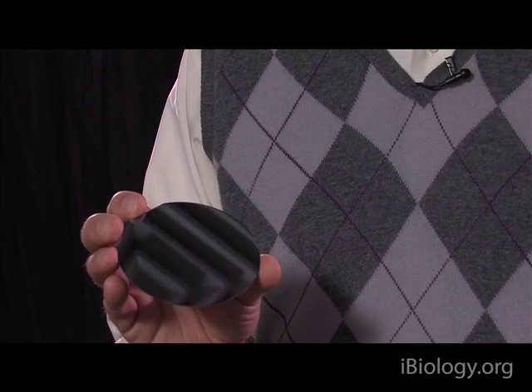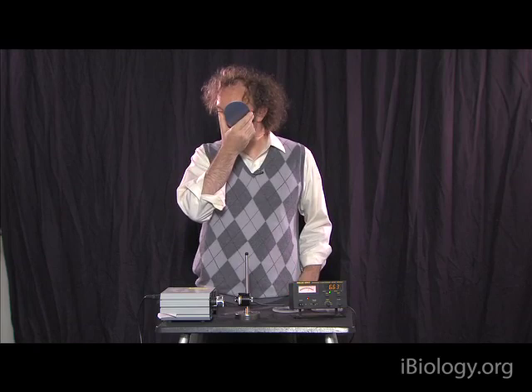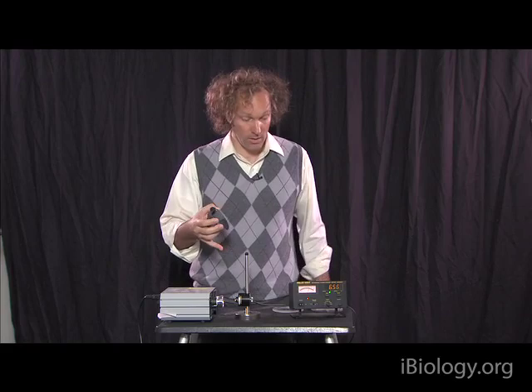So maybe you can see this a little easier. It's highly reflective. It's a piece of silicon. And if I put my eye up to it and try to look, I see nothing through it. So I might expect, when I put this in between the light source and the detector, that I would extinguish all of the intensity, that I would block all of the light. So let's try that.